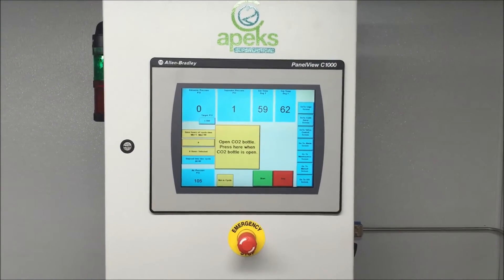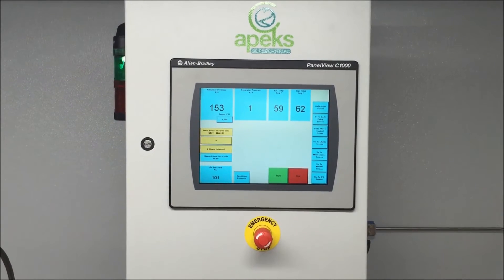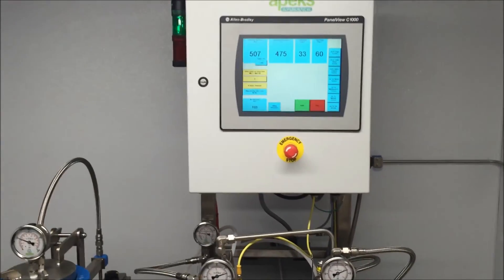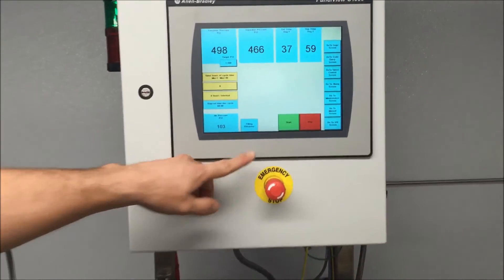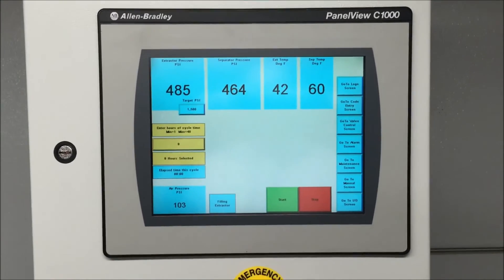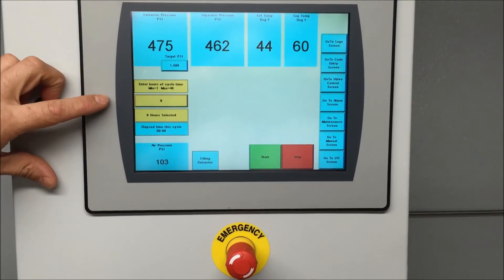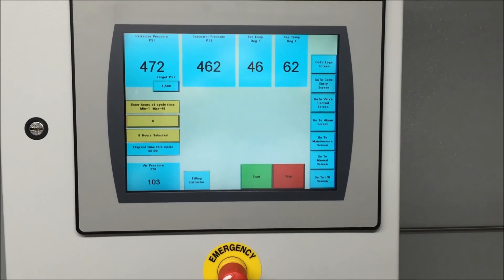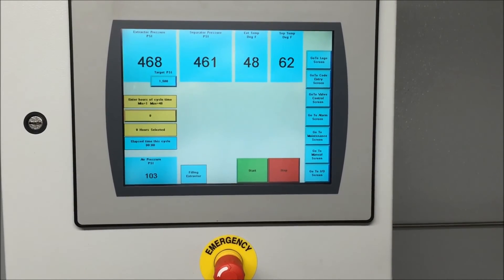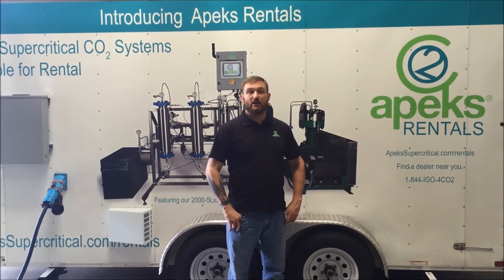Now when I acknowledge that the CO2 bottles are open, the system is going to take off and do its run. As you can see the system is filling. Once we reach our set point at 1,500 PSI, the system will go into run mode and continue to run for whatever set time we put in — in this case nine hours. Then the system will go into recovery; it should take about 30 minutes to pump the CO2 back into the CO2 bottles. Then we will open valve 10, vent out the remaining CO2, and collect our oil. So now I have the system running — I'll be back in a few hours to check on it and collect the oil.